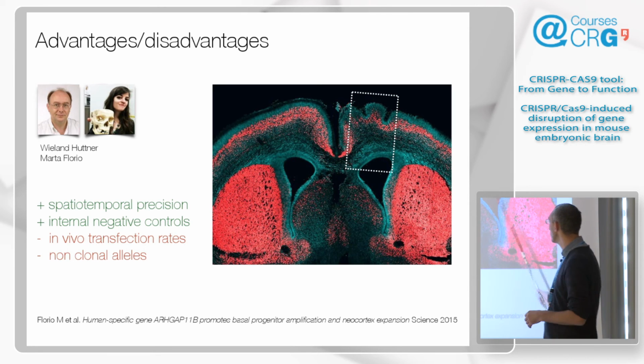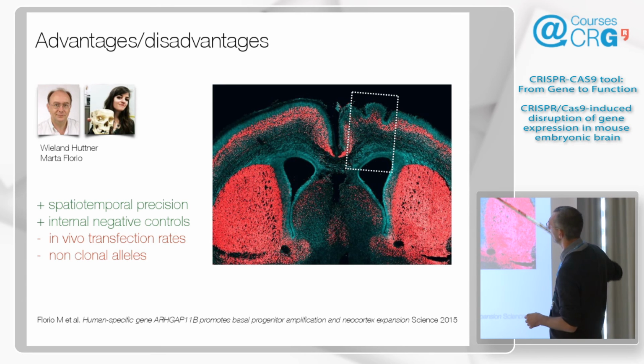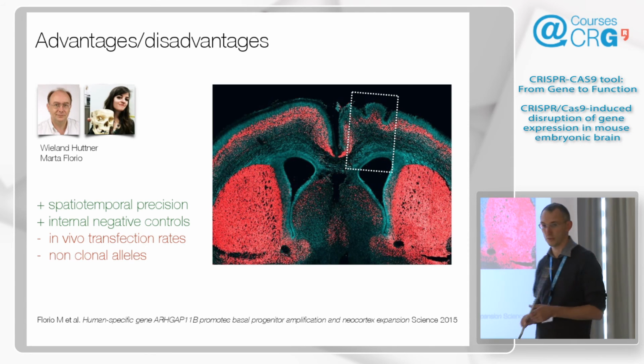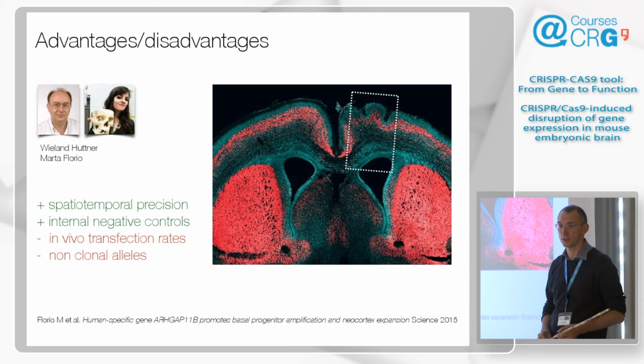And then there's a plasmid here that they are electroporating in this direction in an earlier stage into the mouse brain. So now later, when the brain develops, you'll see that on this side there's a proliferation and they form gyri kind of like us. Whereas the control on the left side is completely smooth, as it's normally in the mouse cortex.